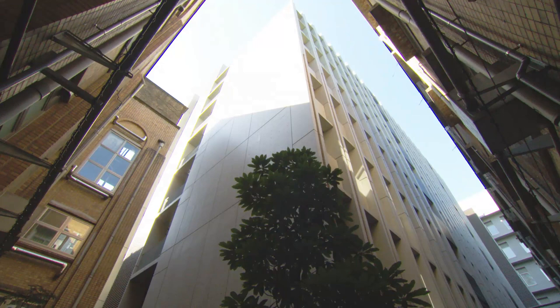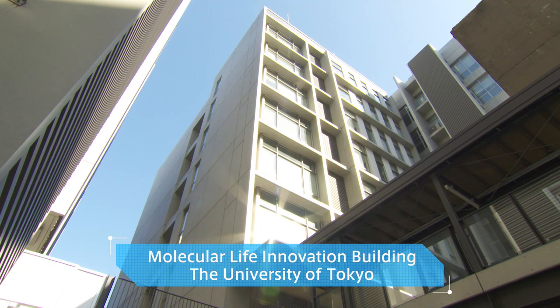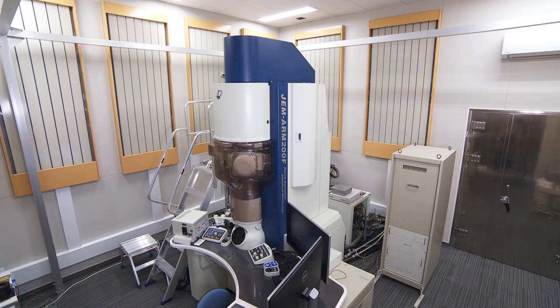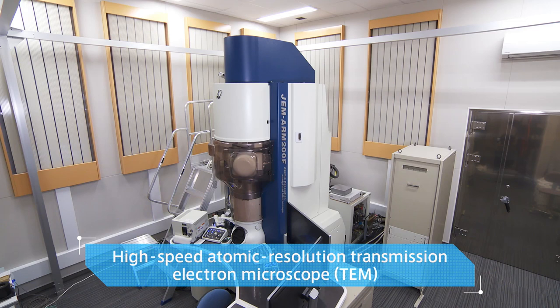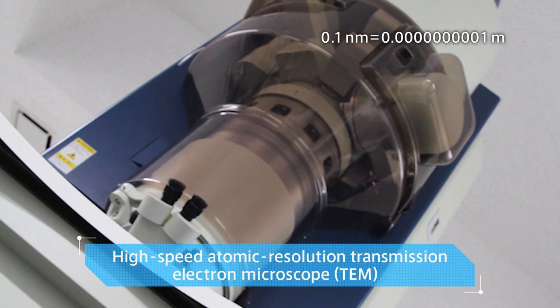The electron microscope used for this video imaging is located in the Molecular Life Innovation Building in the Hongo campus of the University of Tokyo. By using this electron microscope, it is possible to create continuous video imaging at a speed of 1,600 images per second, with an accuracy of less than 0.1 nanometer.